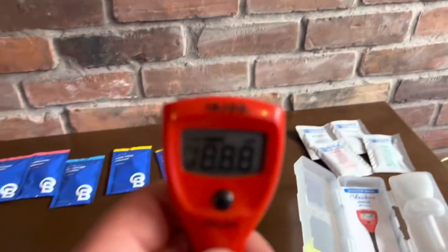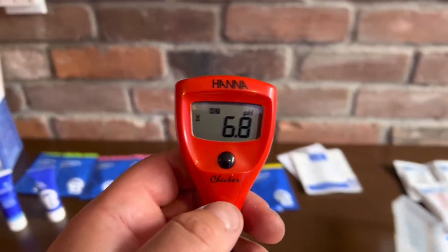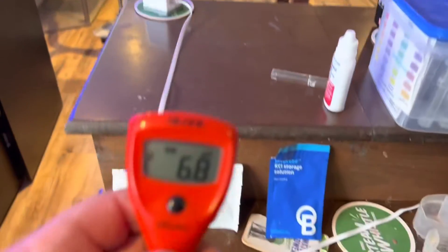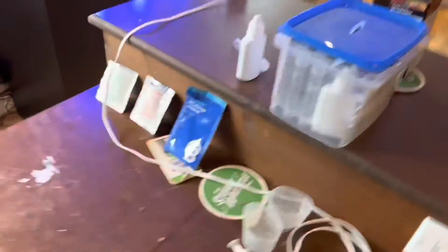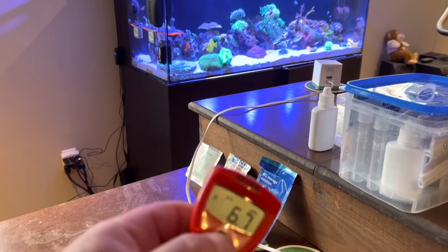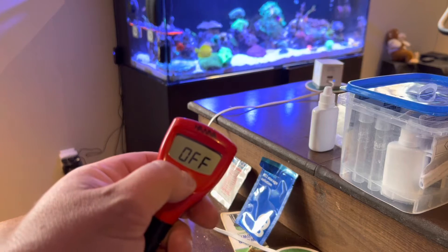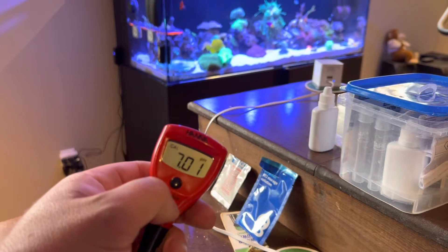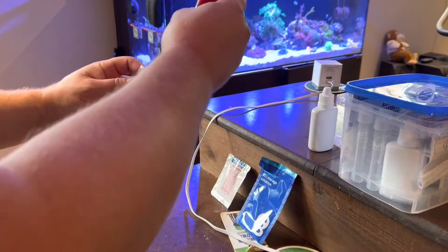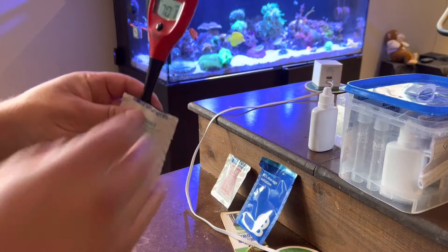All you've got to do is push the button once and she fires up. We're going to hold the button — keep holding it. It says 'cal' now. It wants 7.01 solution, so here's the 7.01 solution and we're going to put it in there.